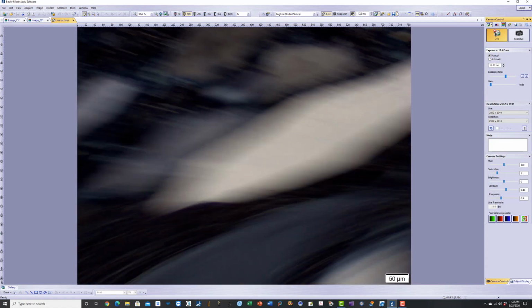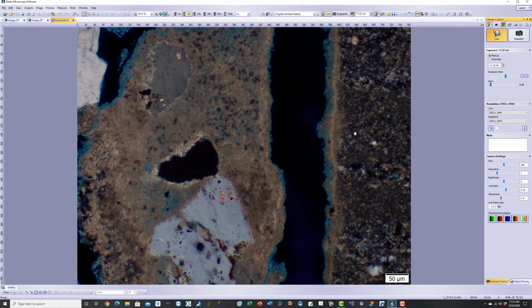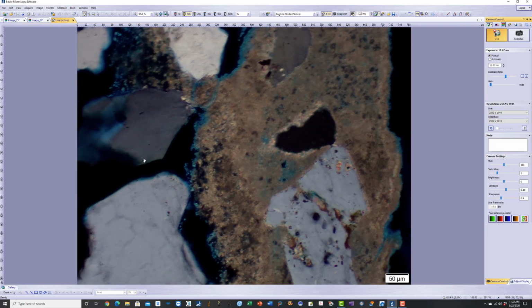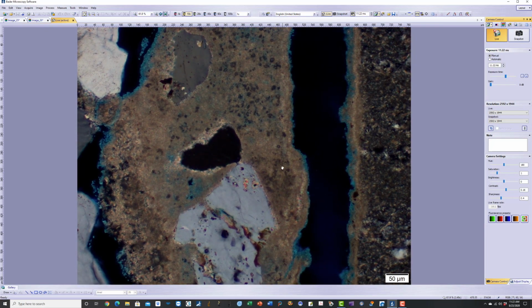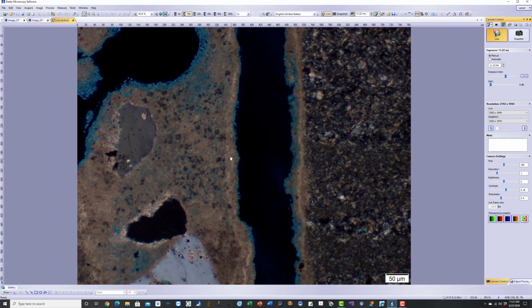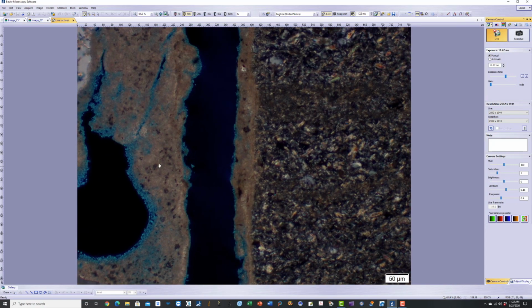Let's go to the jointing mortar. There is the mortar. This is the interface. You can see the carbonation at the interface between the slate and the mortar joint. This is the carbonated portion of the joint where the paste has been carbonated. You see some residual cement particles still present in the Portland cement paste, which has been severely carbonated along the interface.